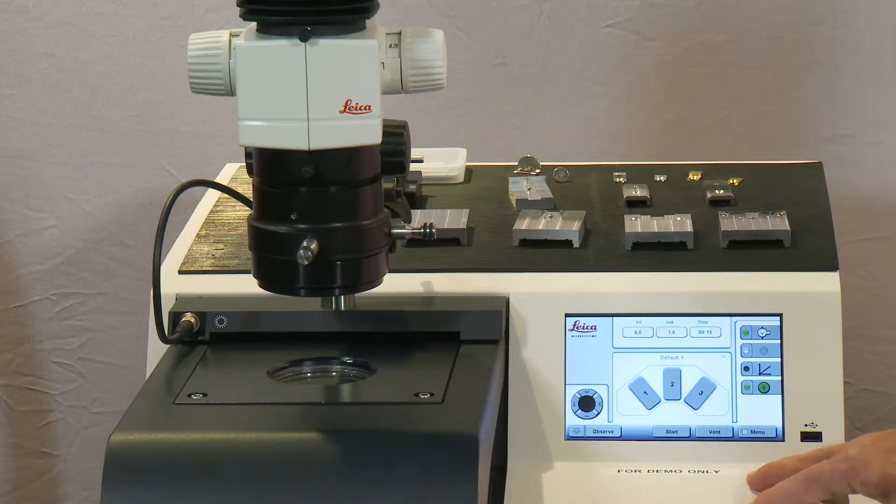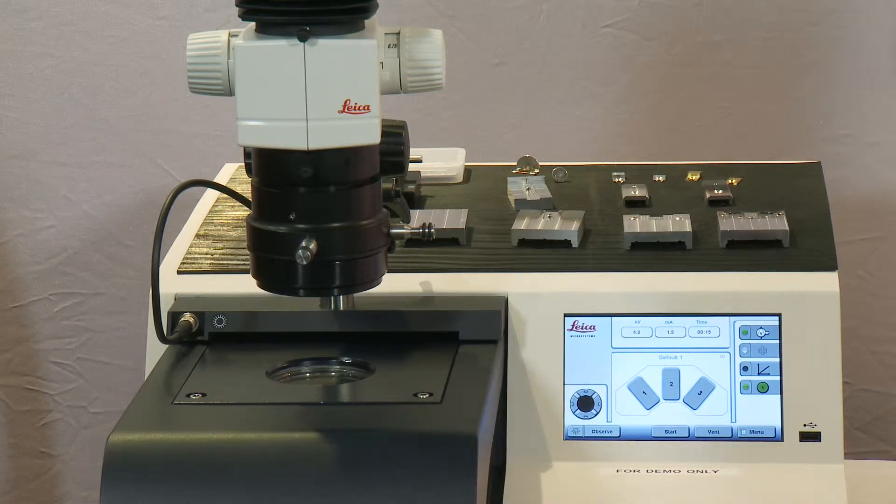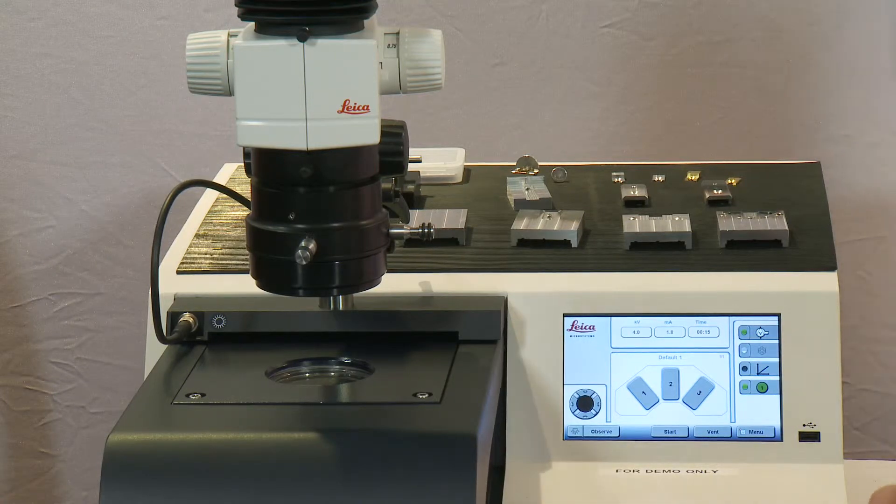The system functions with three ion argon beams that are produced from three fixed saddle field guns, and these three guns are focused on the sample in the center position, each one milling away other material that's redeposited from the first one.